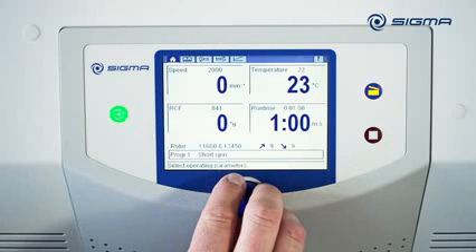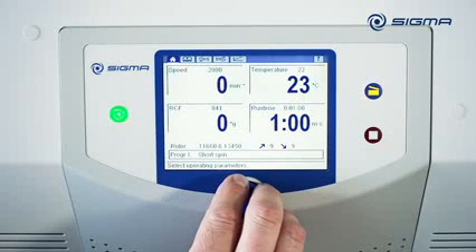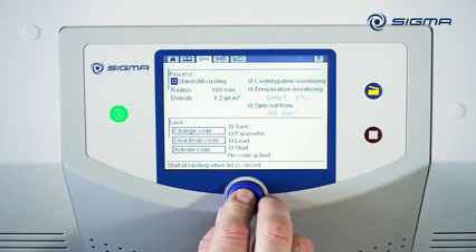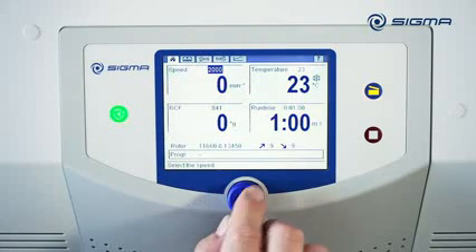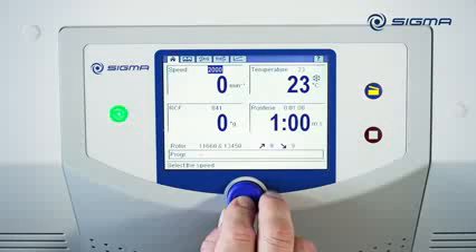The Sigma SpinControl S centrifuge controller can be individually configured for different applications. If you enable the Standstill Cooling option, a nice crystal icon is shown on the main overview. The centrifuge temperature remains constant, even when it is not running.